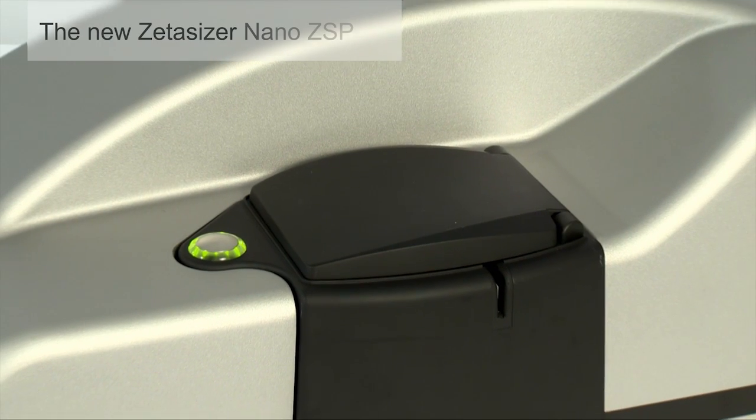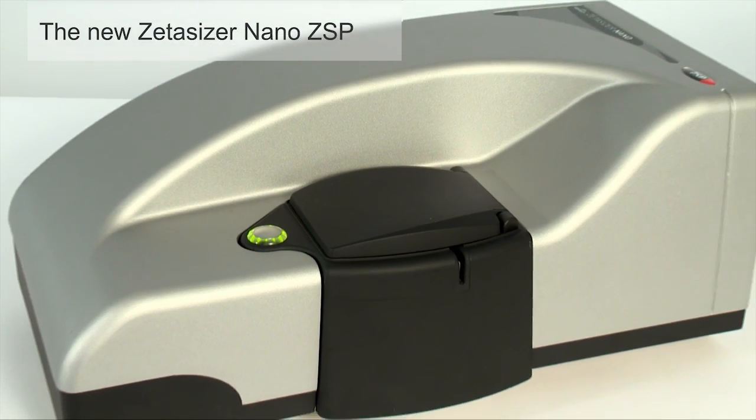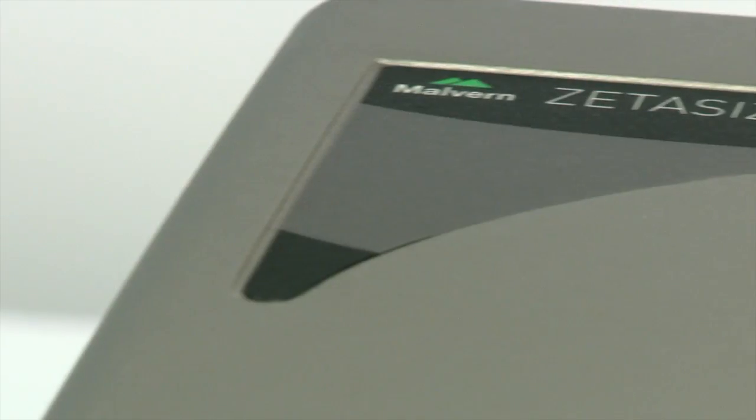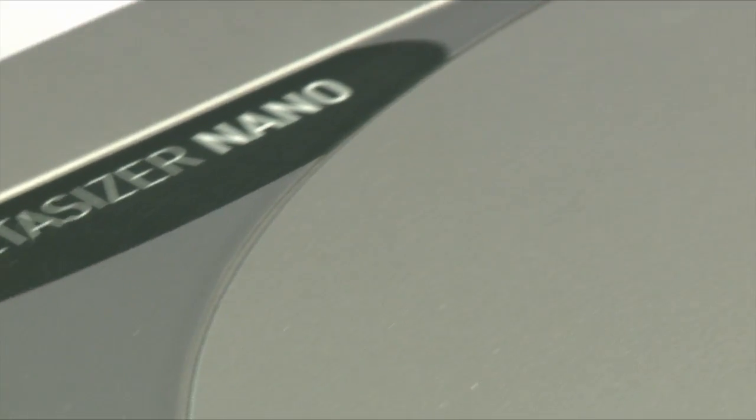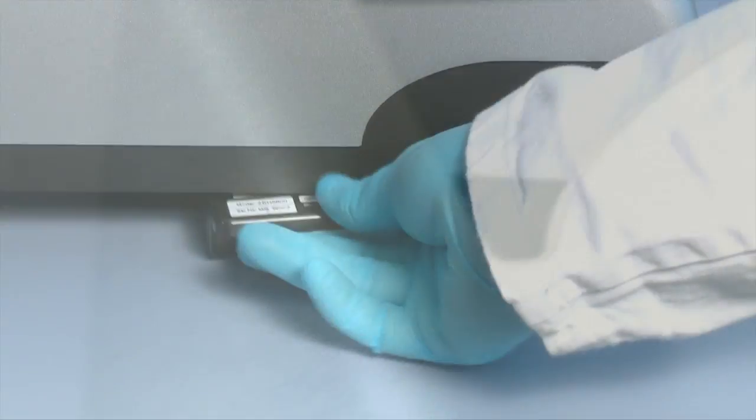The Zetasizer Nano ZSP is a new premium addition to the Zetasizer Nano range. This video demonstrates how the tenfold increase in Zeta potential sensitivity is used with the new protein mobility measurement type to reliably measure protein mobilities and calculate protein charge.